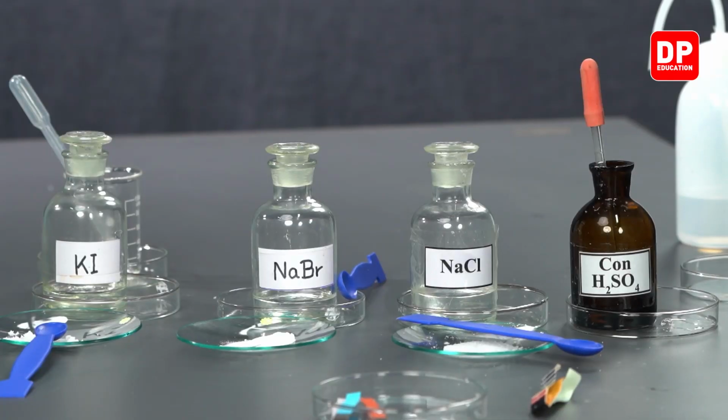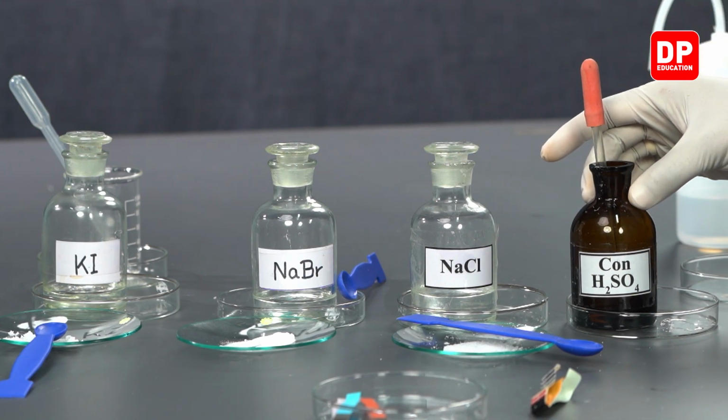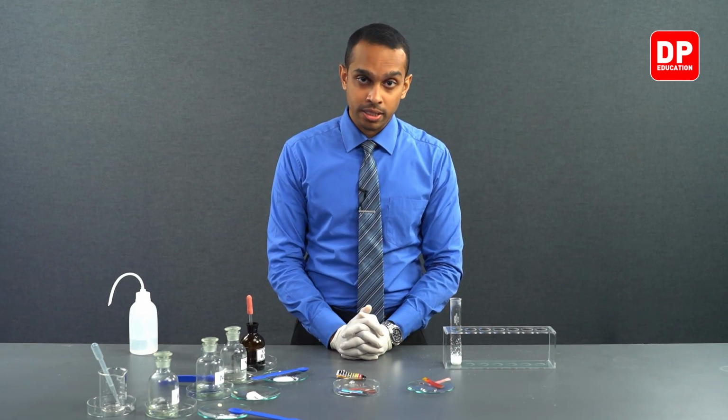We tested its acidity with pH paper as well as blue litmus paper. So we confirmed the gas that is produced is acidic. So the gas that was produced upon addition of concentrated sulfuric acid was HCl. We cannot identify sodium chloride by adding concentrated sulfuric acid, as the gas that is evolved is going to be colorless.